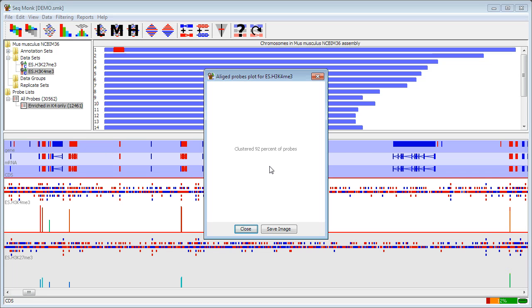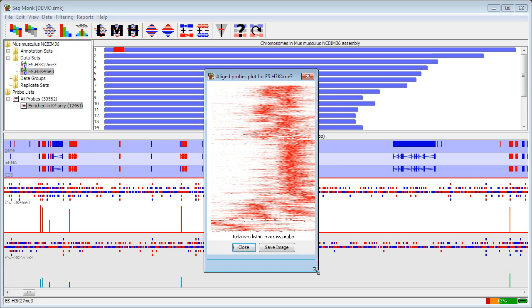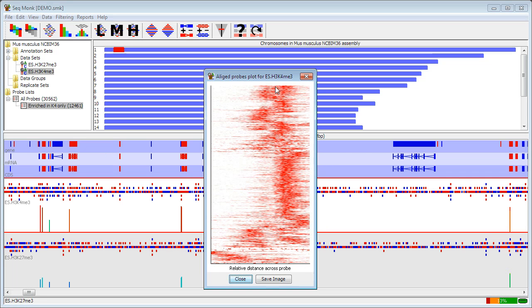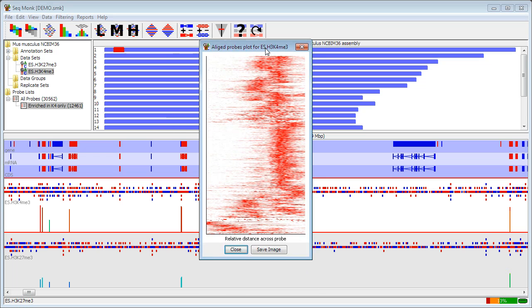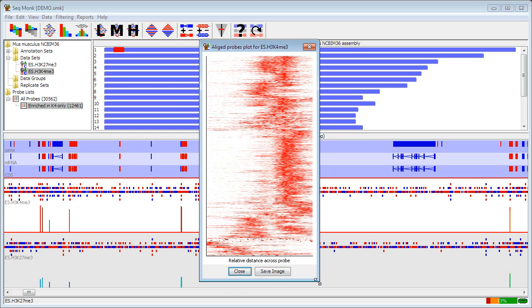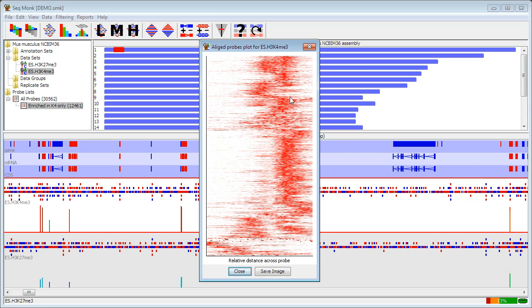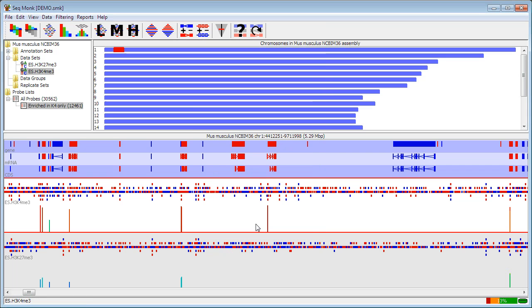Plot will calculate and I can now see a similar sort of plot to what I had before so the bottom of this graph shows a distance across each probe so my transcription start site is going to be somewhere around here. And now I can see subpopulations within my set so I have some that are only enriched after the transcription start site, some that are enriched completely through before and after the transcription start site and some that are only enriched before the transcription start site and not very much afterwards. So if I was interested in these I could start pulling those out separately and looking at those. So this sort of quantitation is a way that you can get a much more systematic view of your data to see what's going on.